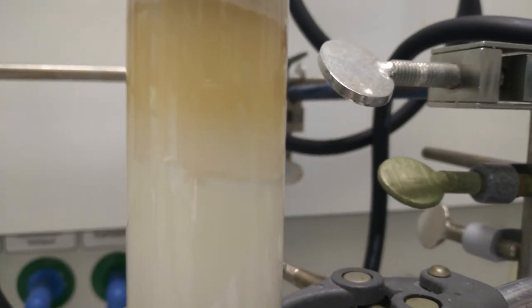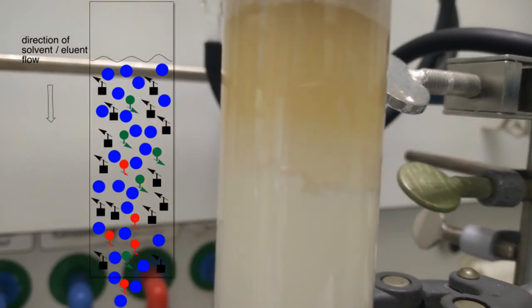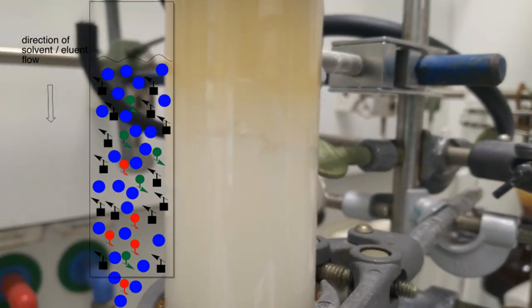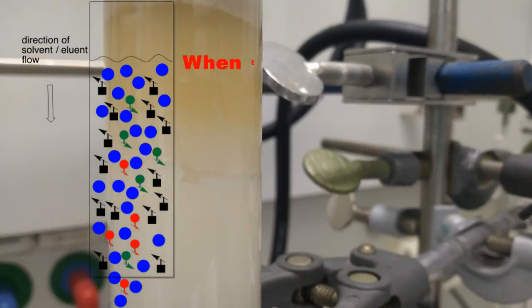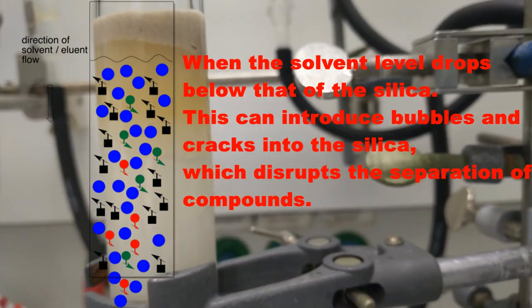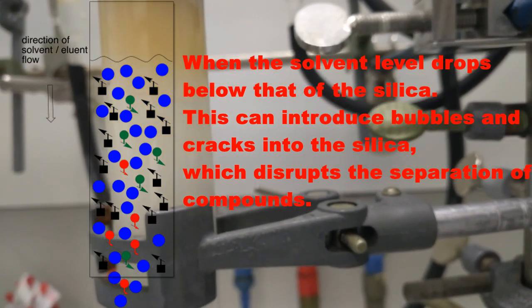Cracks and bubbles in packing of silica are a major cause of failure of column chromatography because they lead to mixing of fractions. This occurs when the solvent level drops below that of silica, or maybe because of reverse pressure.